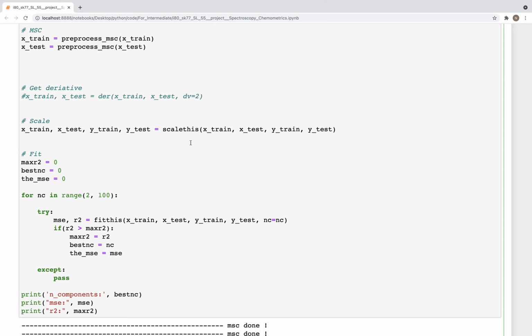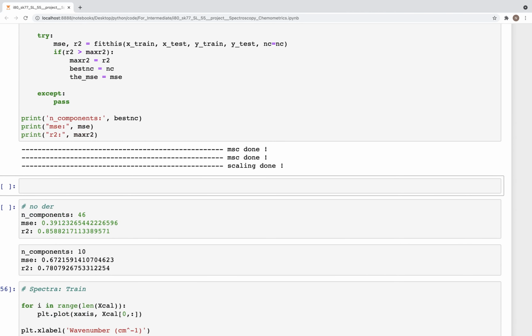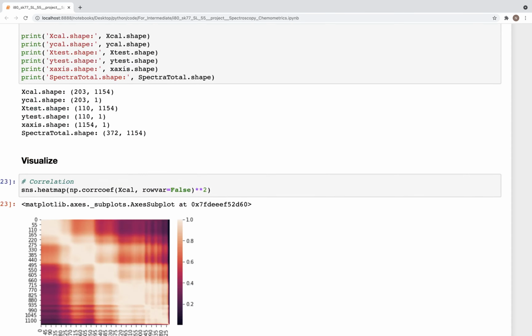And in the paper, if you want to dig deeper, there are other ways in which they analyze the data, find new features, and adding those features could further improve the accuracy of the models. We cannot compare this with the iodine Excel file we have, because we don't know which spectra each of those records belong to, unless they match the spectra array.